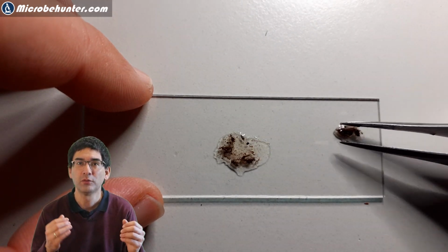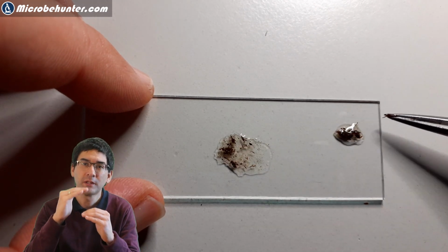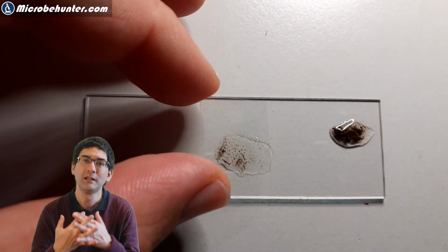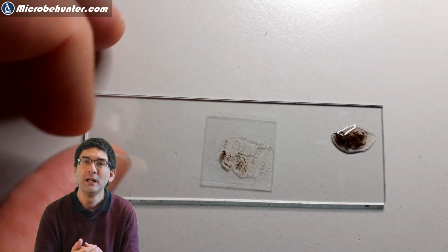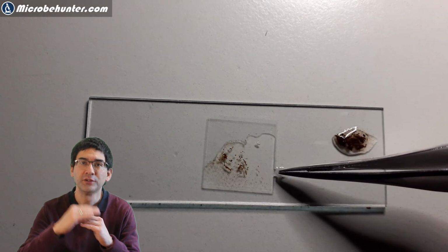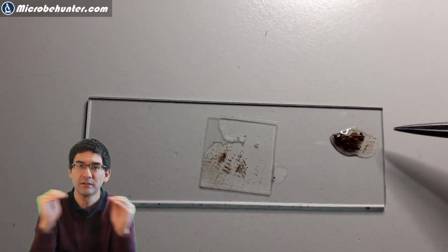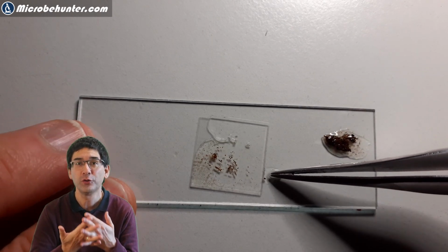So here you can see I'm removing all of those wood pieces, because otherwise the cover glass won't be able to make a very good contact. And of course there might still be a little bit of air there, so I would suggest that you fill it up with water again, but make sure that the cover glass is quite flat, and maybe you want to press it down a little bit, because you want to make sure that the amoeba, they don't move vertically. They should actually stick on the slide and stay on one level. It makes it much easier this way for you to find them.